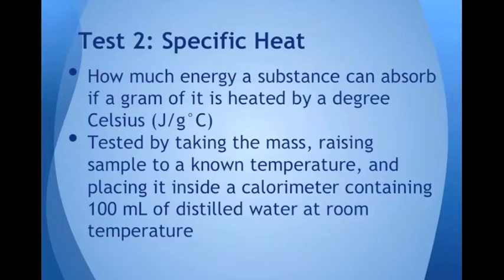The other test we're going to be running is finding the specific heat of the unknown substance. And as most of you know, I'm sure, specific heat is how much energy a substance can absorb if a gram of it is heated by 1 degree Celsius.